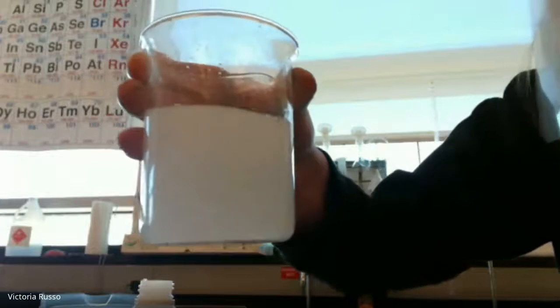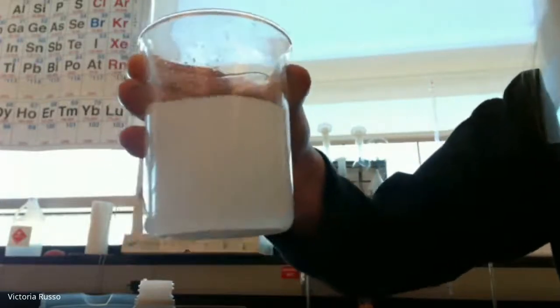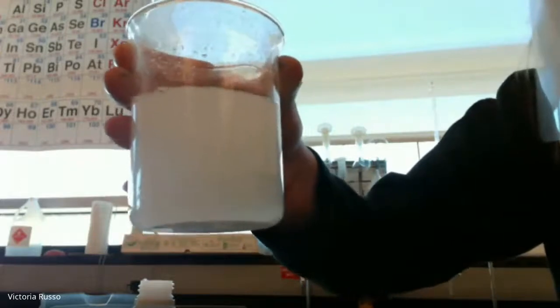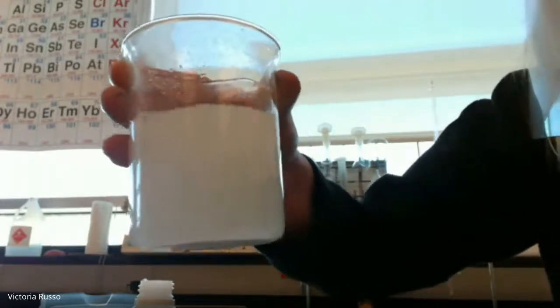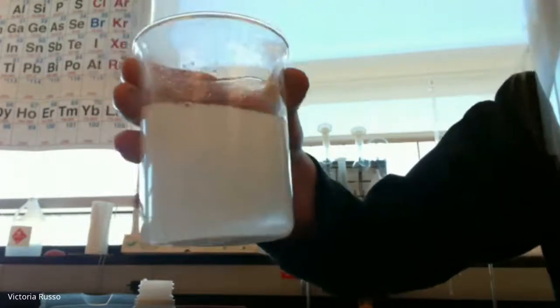We did this in honors bio, but that's the hydrogen gas reacting. If I feel this, it's getting warm to the touch, so that means it's exothermic. So that's what was occurring inside the calorimeter, which you couldn't see. You can also see that the solution is getting cloudy. That is the production of magnesium chloride, which is a white solid. So it's producing so much that the water can't dissolve it all right away. And you can see it settling down to the bottom a little bit.